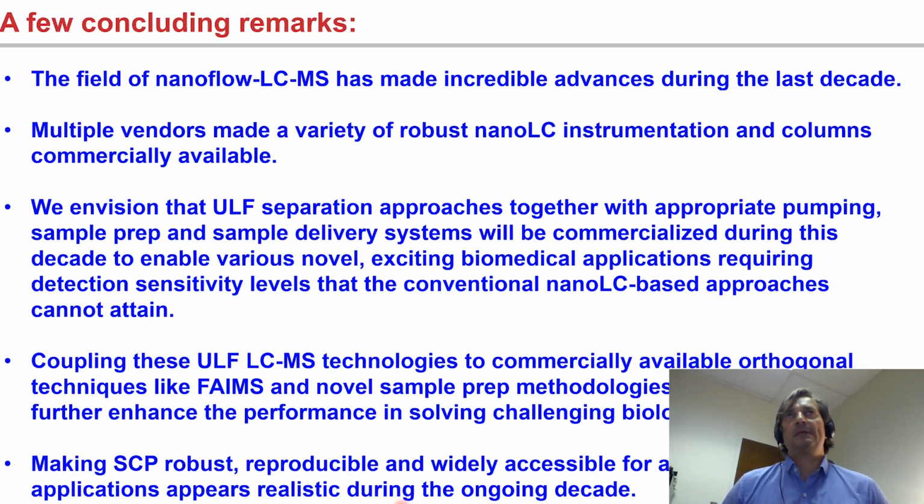single cell proteomics can benefit from that. So I hope that jointly as a community and together with instrument vendors, we can make that push and bring the separations to a different level. Mass spectrometers improved quite a bit during the last 10, 15 years. So, and then interfacing, including something like FAIMS interface and other improvements, even simple pull tips, coated, non-coated, how we couple them together. Again, I'm referring to some of the slides shown yesterday by Ryan Kelly, union or integrated column, what have you.